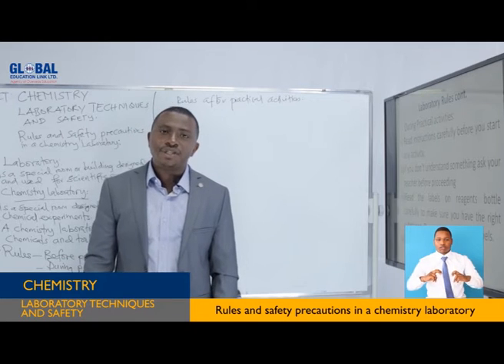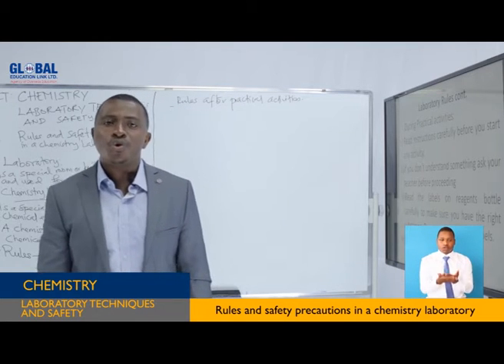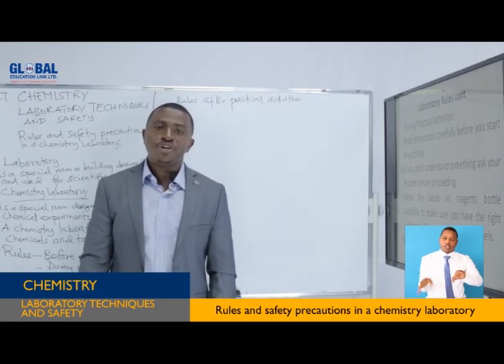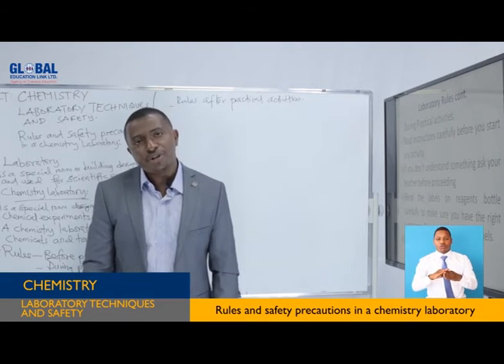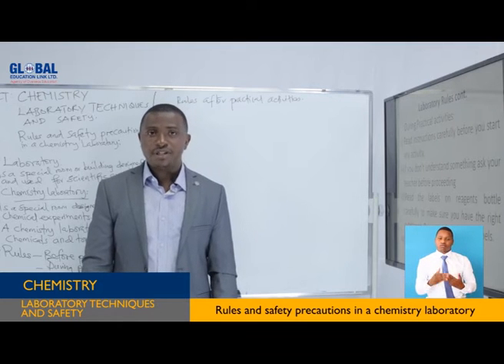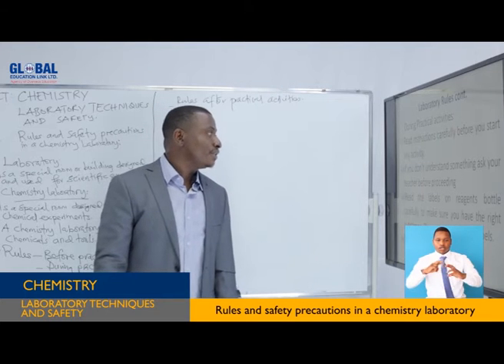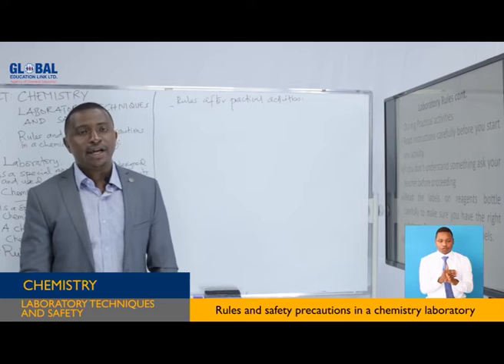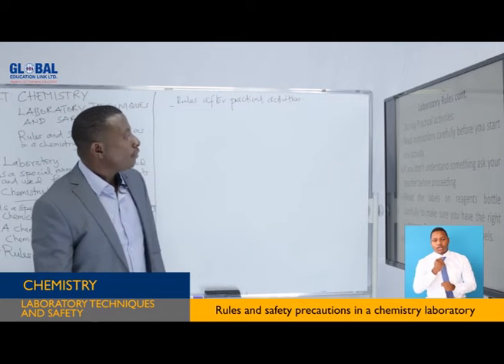And the instructions make you know what specific chemicals you will use during your experiments. So it is very important that every student during practical activity should read the instructions properly before starting any activity.